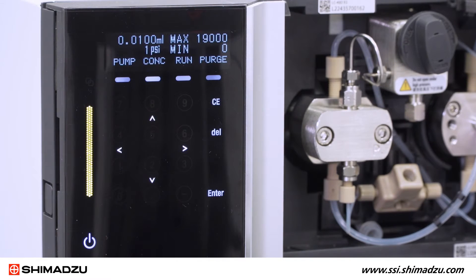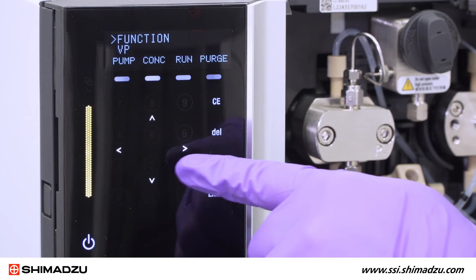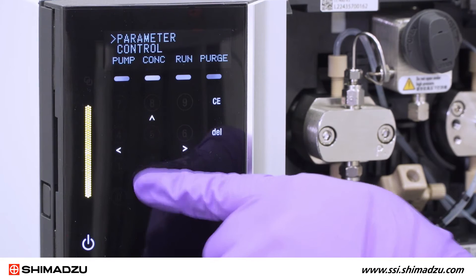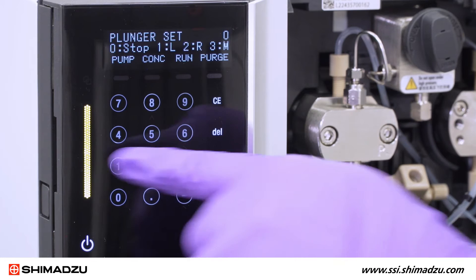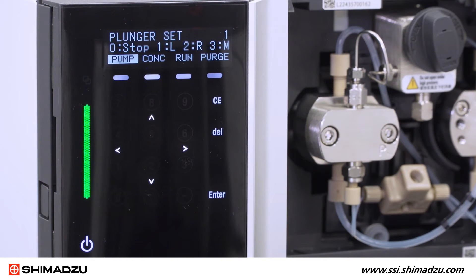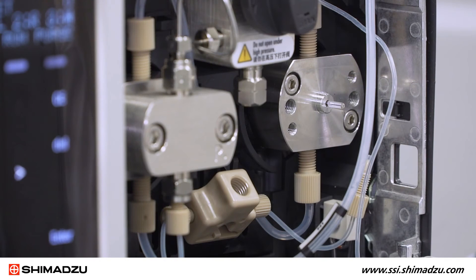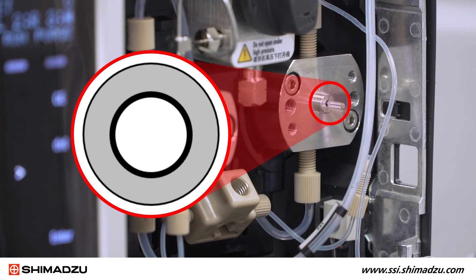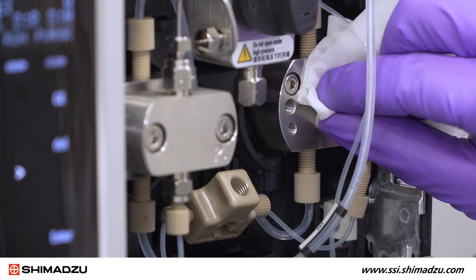Now you can set the right plunger to the front position. Using the pump keypad and arrow keys, select Function, Control, Plunger Set. Then press 1 and hit Enter. The right plunger is moved to the front position. Using a magnifier, make sure the plunger is centered and the gap on each side of the plunger looks even. Clean the surface of the plunger with a kimwipe and isopropanol.